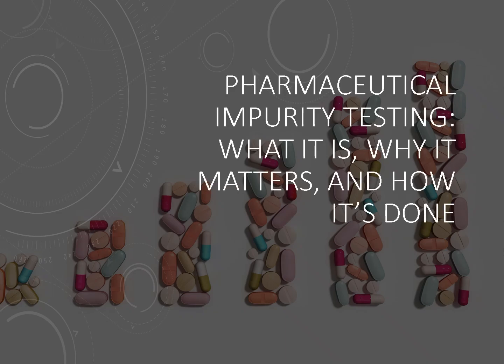Pharmaceutical impurity testing plays a critical role in ensuring the safety, quality, and effectiveness of medicines. In this presentation, we will explore what pharmaceutical impurities are, why impurity testing is so important, and how it is carried out in real pharmaceutical laboratories.